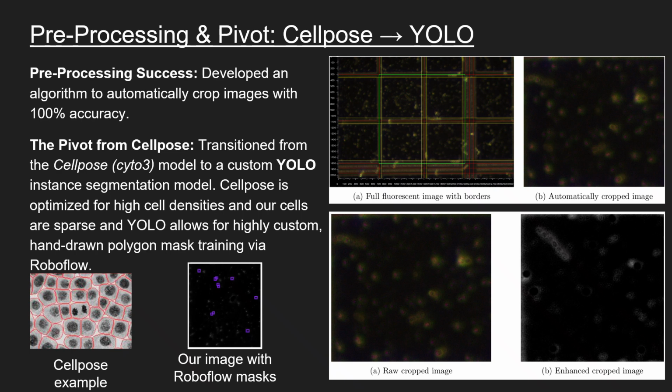Then going below in that image, we process that to try and subdue the glass imperfections based on their color and intensity, and amplify just the bacteria. And we've had varying degrees of success.